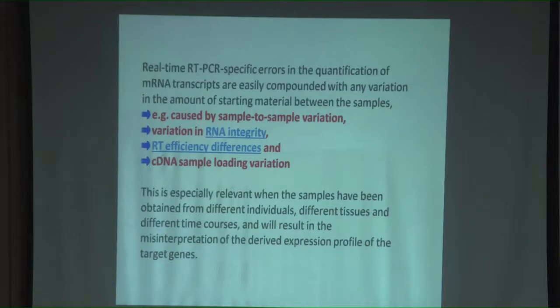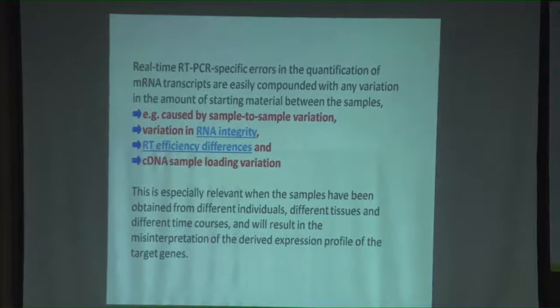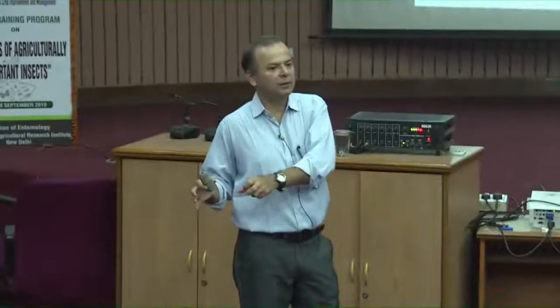Okay. Now, what are you doing? You are trying to find out the difference in the number of copies of mRNA in 2 samples by doing RT and then qPCR, and whatever difference was there can be captured, no problem. But that difference you wanted to see is coming because of difference in gene expression. But how do you take care that the difference is not because of any other error?